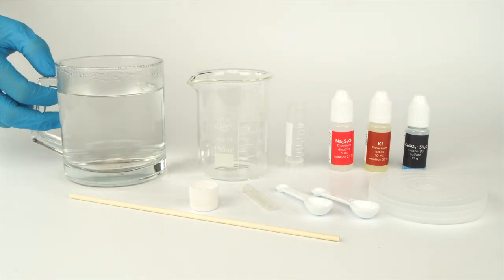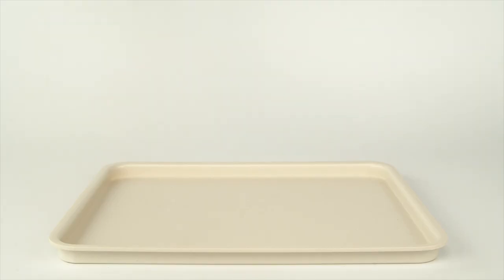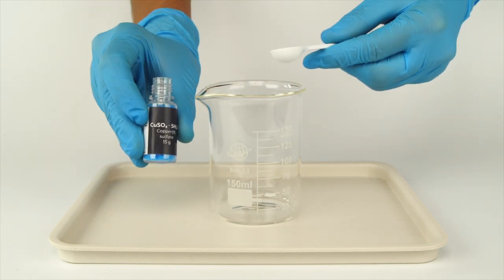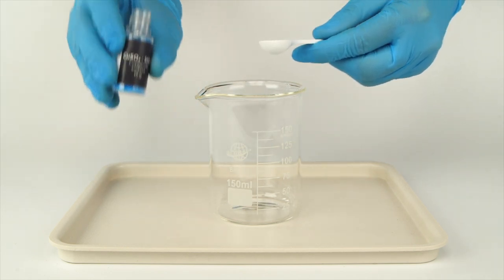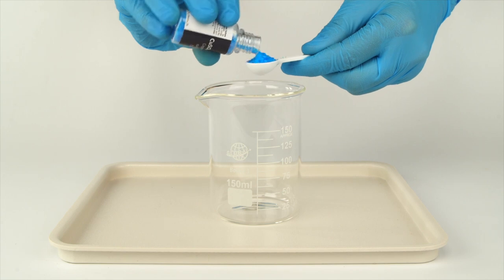Boil some water in advance. Keep in mind that you'll need to rinse your plastic items with water at the end of the experiment. Pour one big spoon of copper sulfate from the bottle with the black sticker into the beaker.